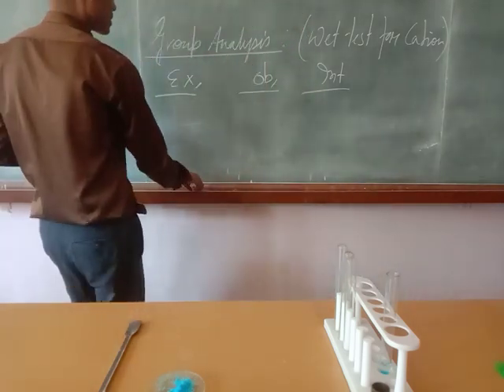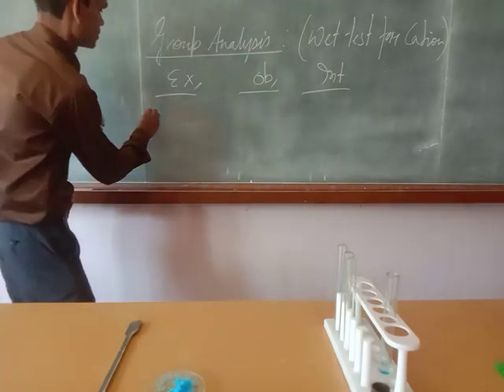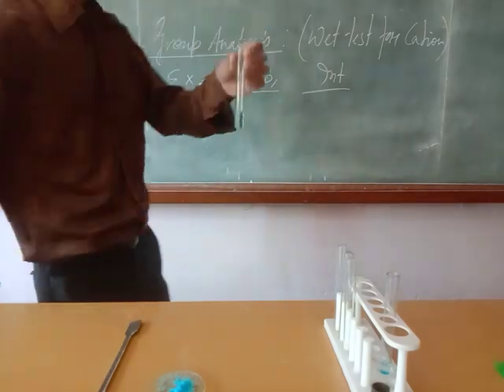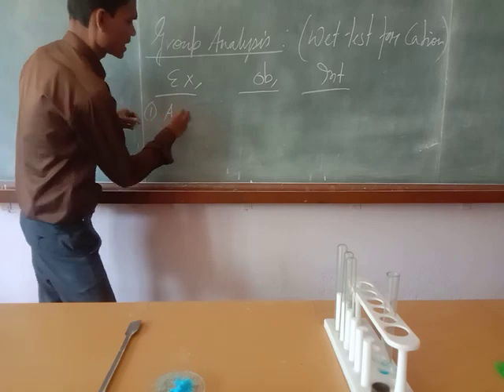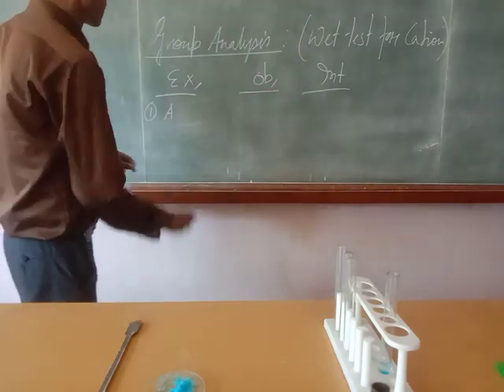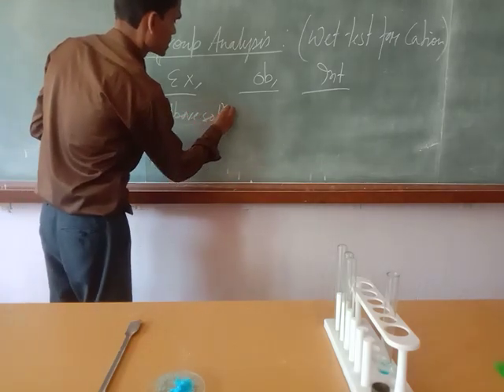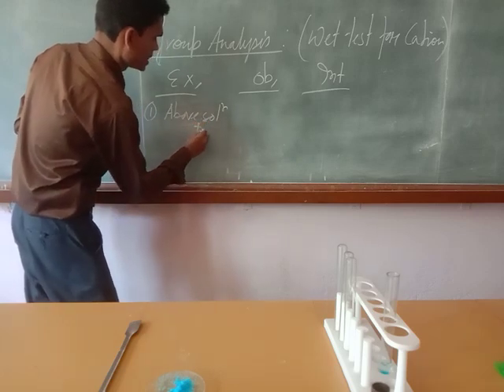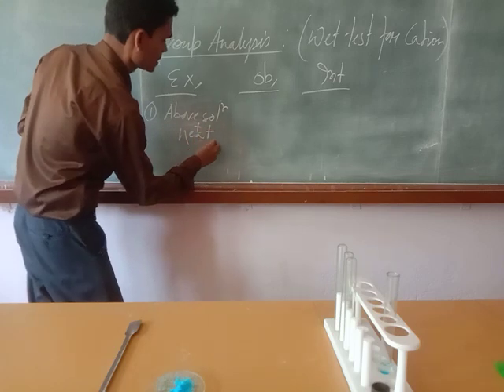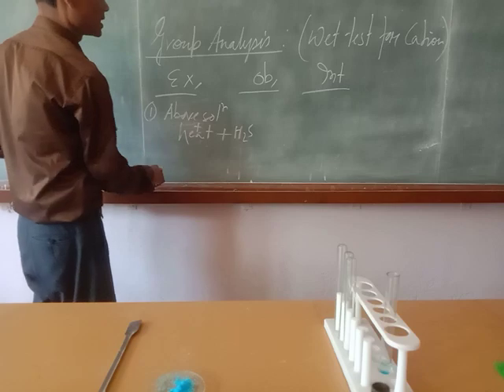Now the test for group 2. For group 2, you take the above solution. Here you write above solution. Above solution means group 1 solution. You do not throw the sample. Above solution plus heat plus H2S, hydrogen sulfide gas.